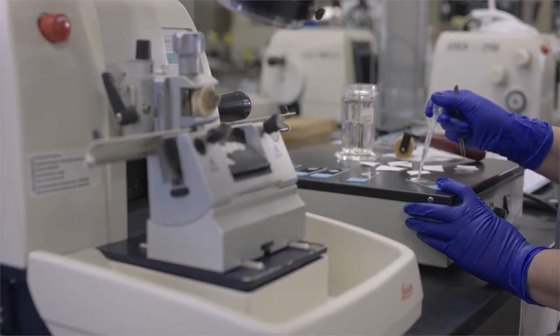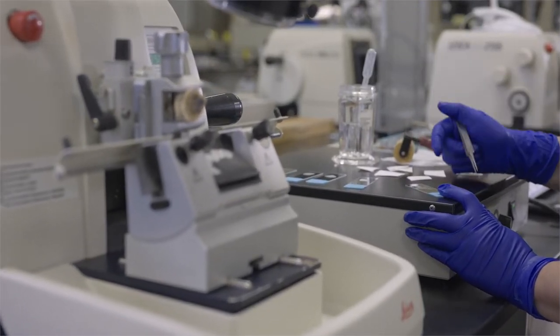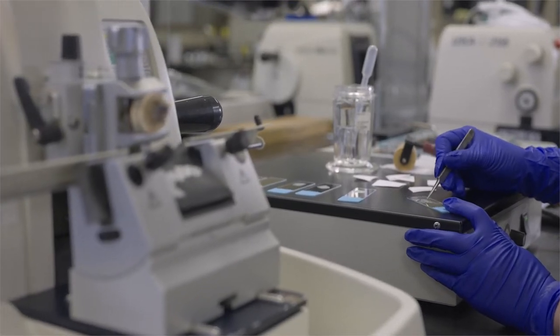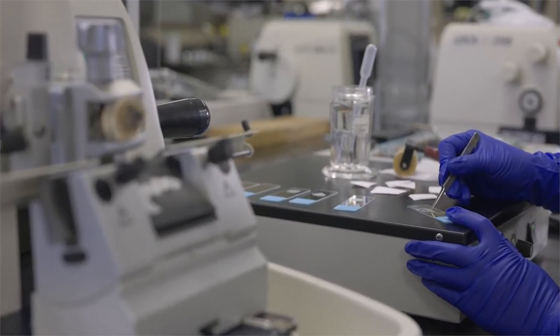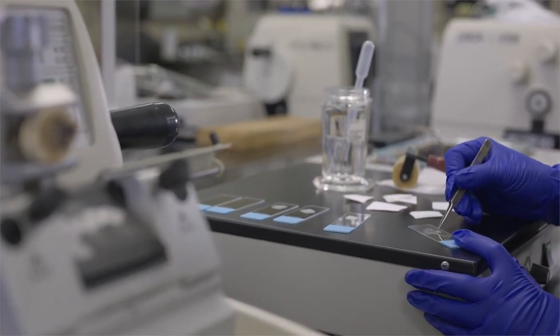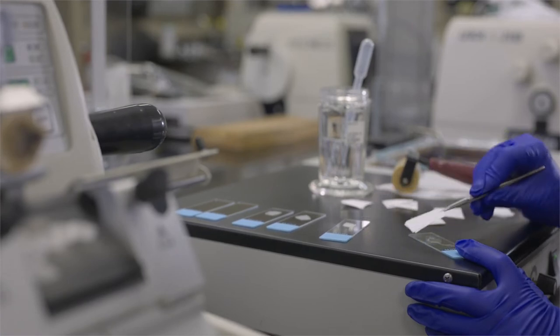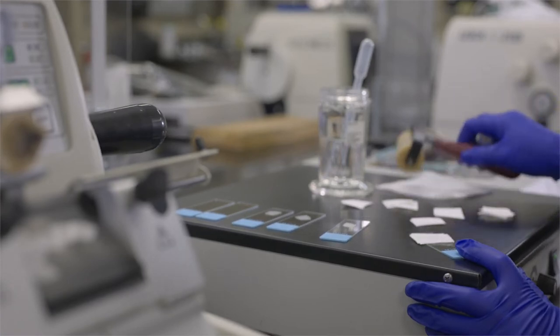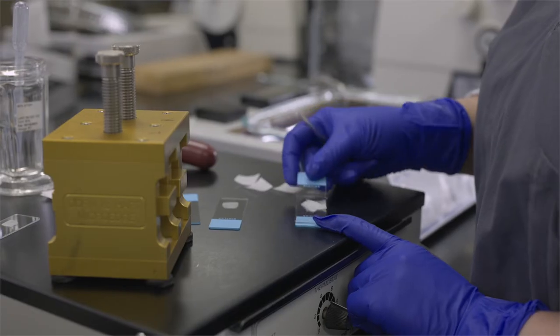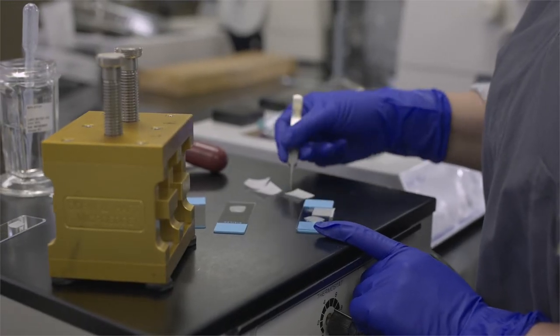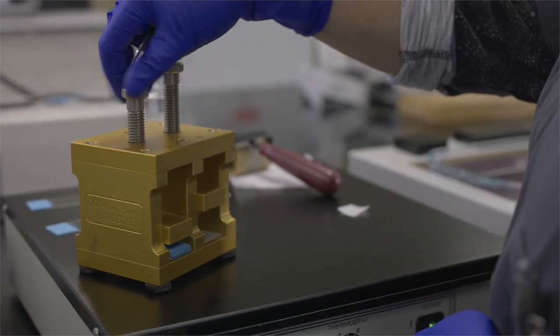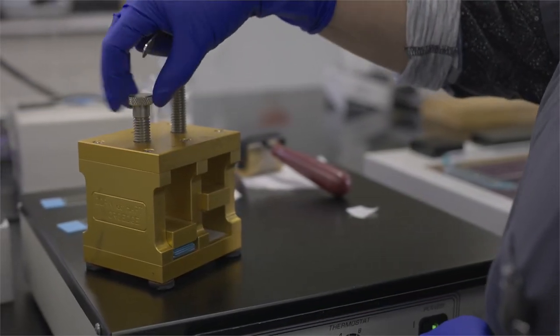Thin section plastic is performed when the device can be sectioned using a tungsten carbide blade. Examples of materials that can be thin sectioned are stainless steel, platinum, and some plastic polymers. The blocks are cut on a microtome at 5 microns. Slides are placed into a slide press in a 60 degree centigrade oven for 48 hours to ensure cut sections adhere to the slides. Once removed from the press, the slides are now ready to stain.